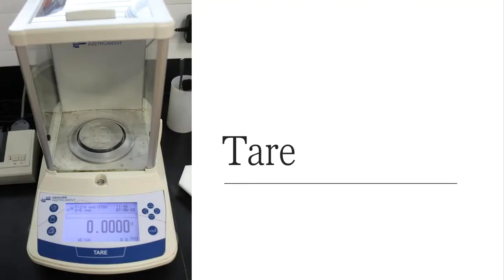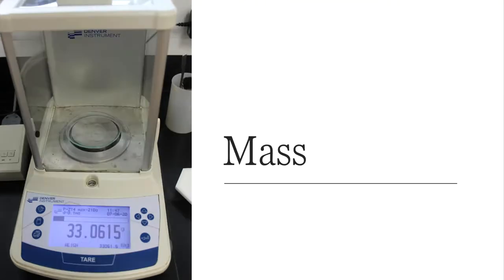All right, so I go back to the tare button of my balance. I re-tare my balance. I then get the mass of a watch glass, 33.0615, because guess what, folks? I can't forget about that thimble in the oven, can I? No, that thimble in the oven, I'm drying that thimble out because it had pet ether and stuff on it. My nuts were soaked in the pet ether. I had to dry all of that off.